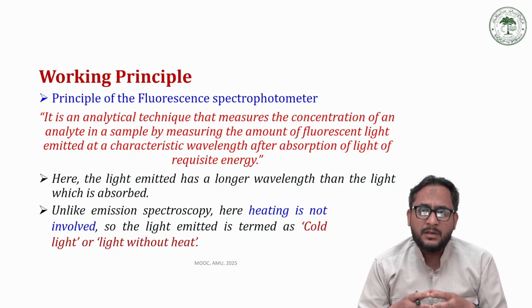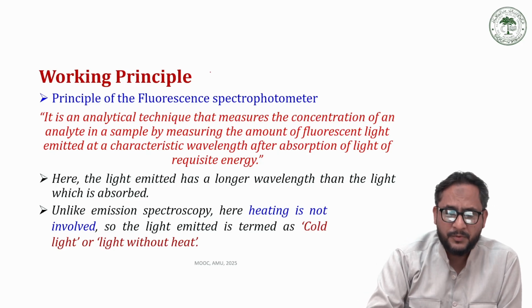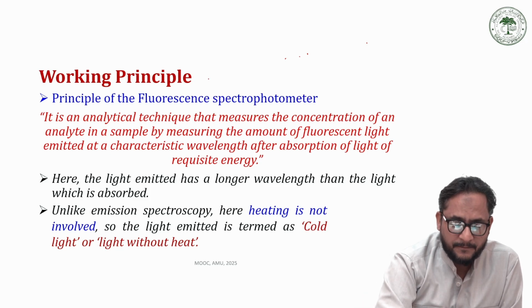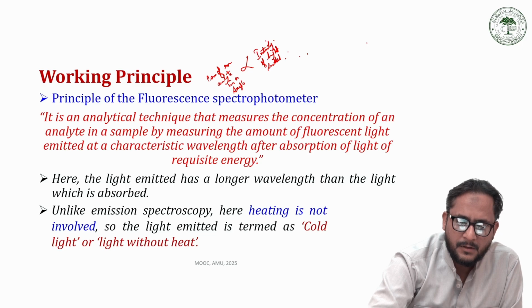Or in other words, I can say that according to the principle of fluorescence spectroscopy, the concentration of an analyte in a sample is directly proportional to the intensity of light emitted upon absorbing light of requisite energy.